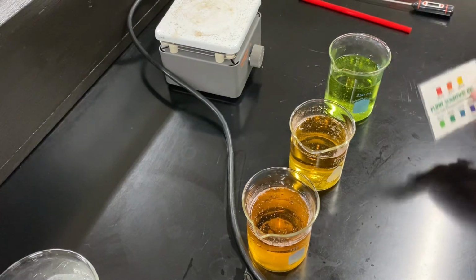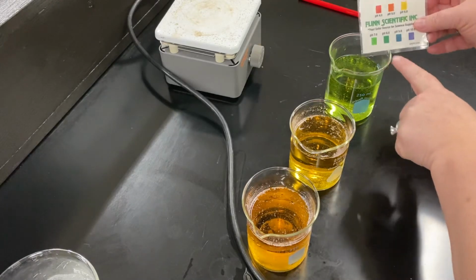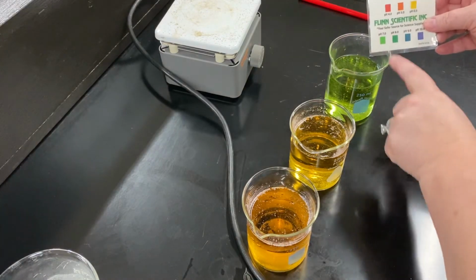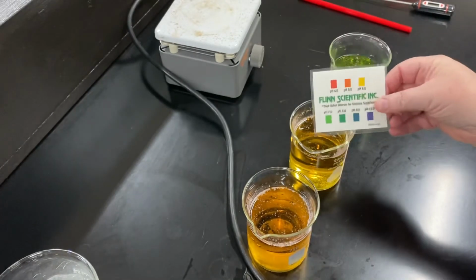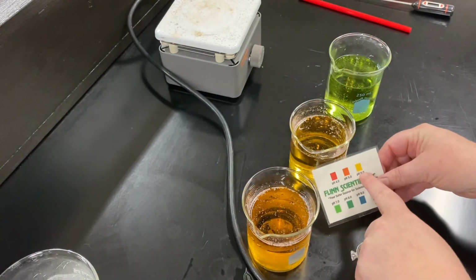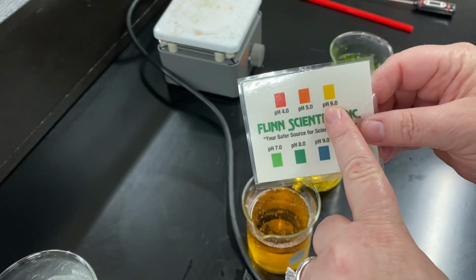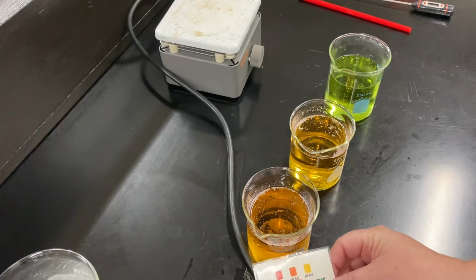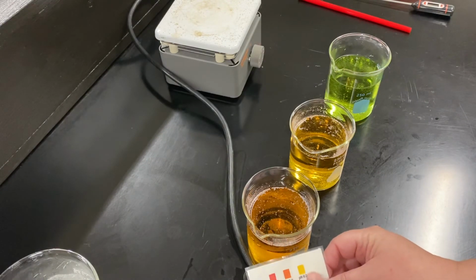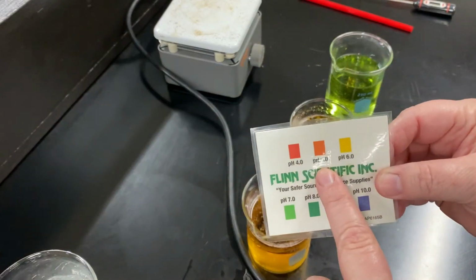Now we need to look at the colors. Okay, so based on the pH indicator, this looks like this lighter green. So we're gonna call that a pH of 7. This one looks more of a yellowy color, so we're gonna call that a pH of 6. This one looks closer to the orange color. It looks partway in between, but we're gonna call it the orange color, and that's a pH of 5.